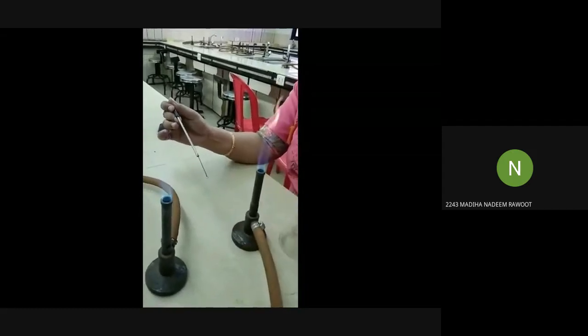Now you can take the slide and fully rub it onto this entire area. You can take the culture only once, or you can also take it twice. Evenly spread it in that entire area. Again, sterilize the loop, keep it aside, and let this slide dry. First we need to air dry the slide, and after that is done, we will heat fix it.